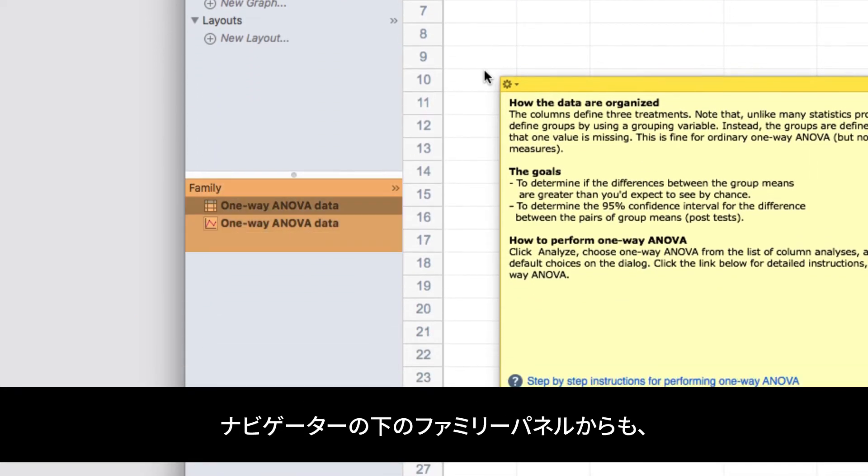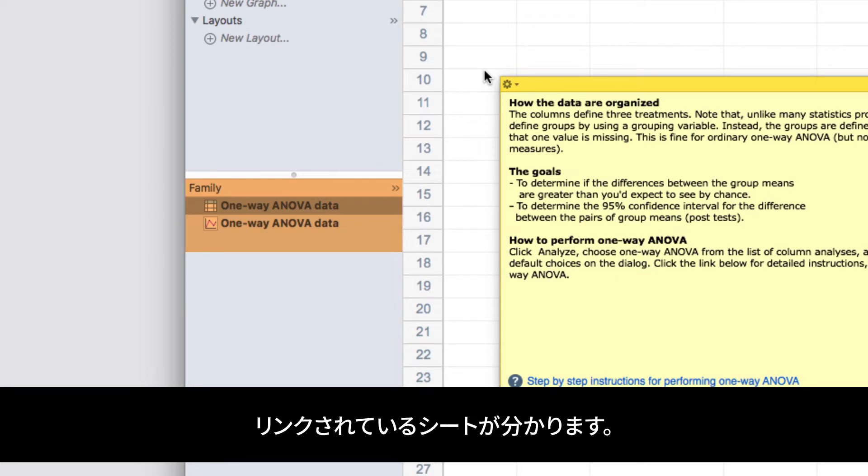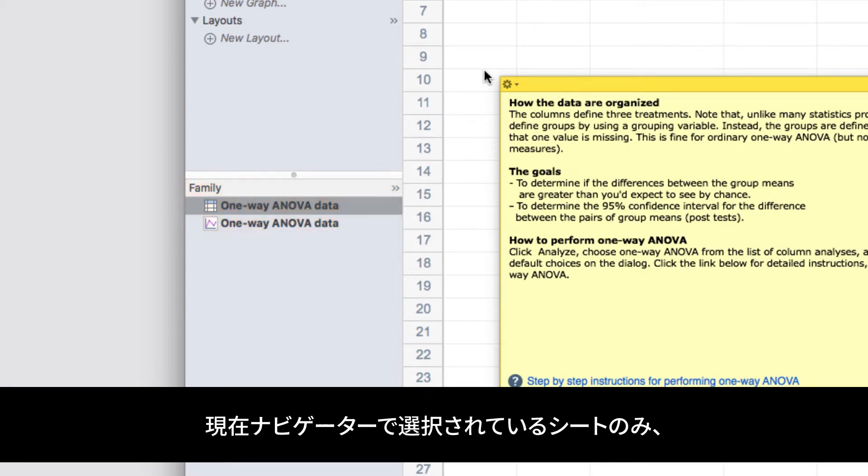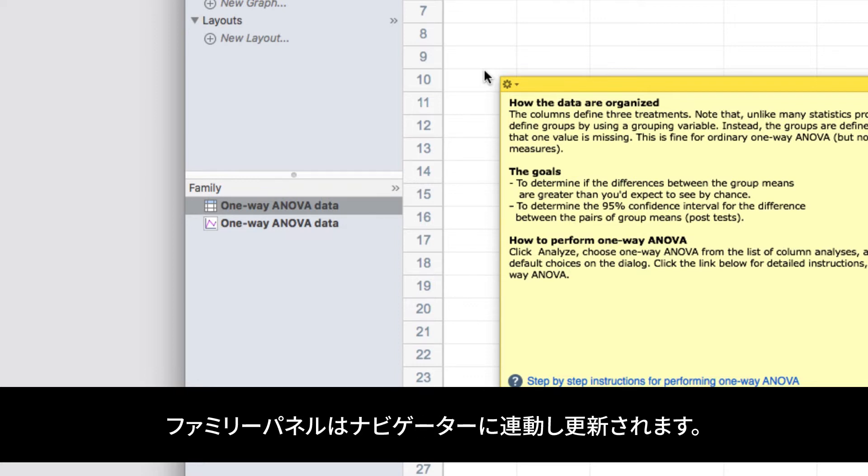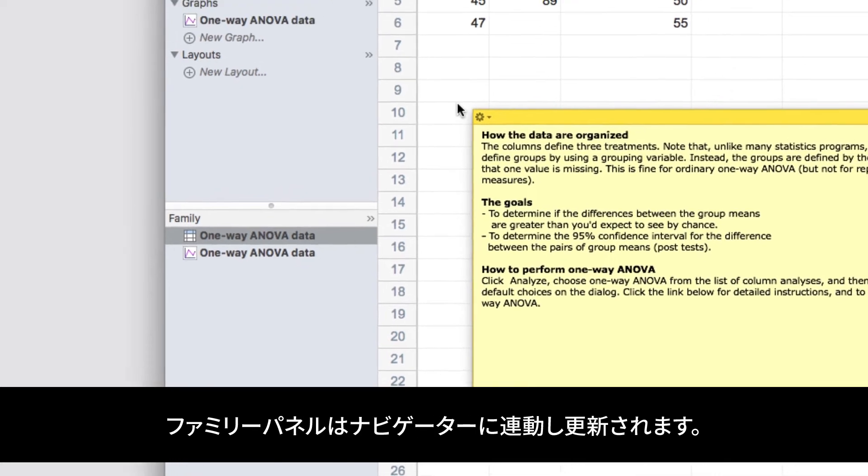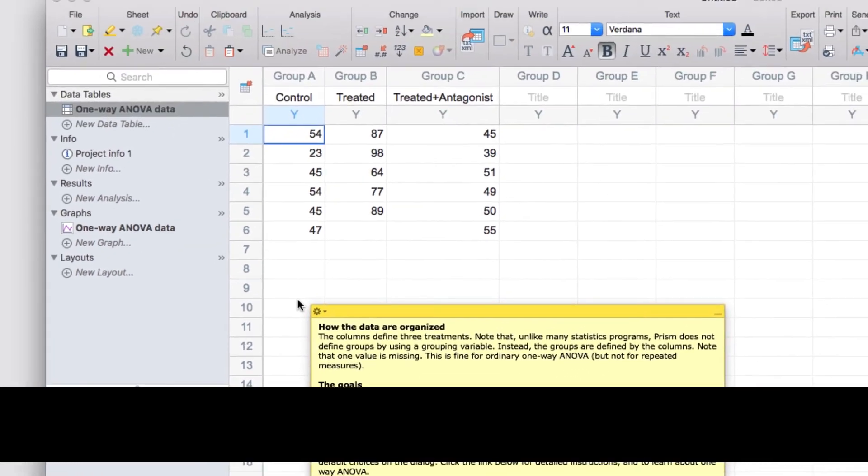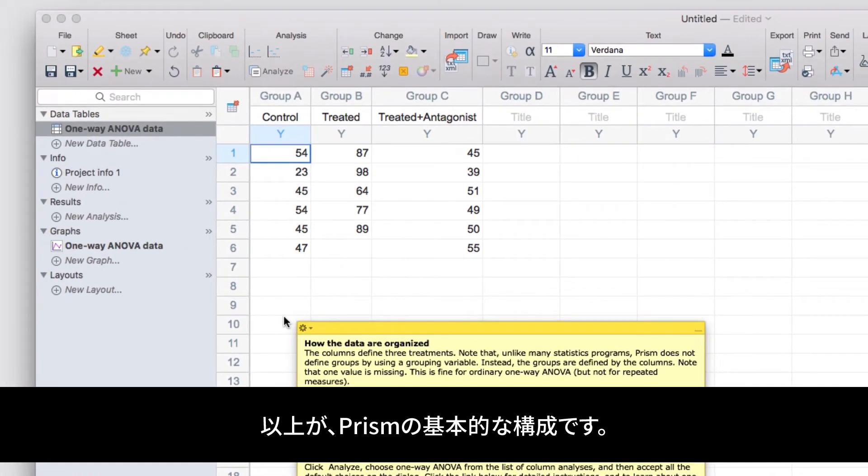Below the Navigator is the Family panel. This provides another way of viewing linked sheets. Only sheets that are linked to the sheet that's currently selected in the Navigator will be shown in the Family panel, and this panel will update when you select new sheets in the Navigator. So that's the basic layout of a Prism project file.